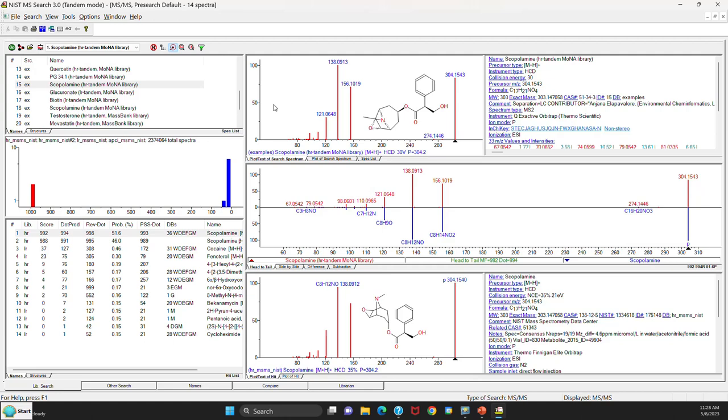A new thing that's been added to the software in version 3 is if you hover over an ion like in the top spectrum here, if it's not labeled by the software, it'll tell you what the value is as you hover over it.